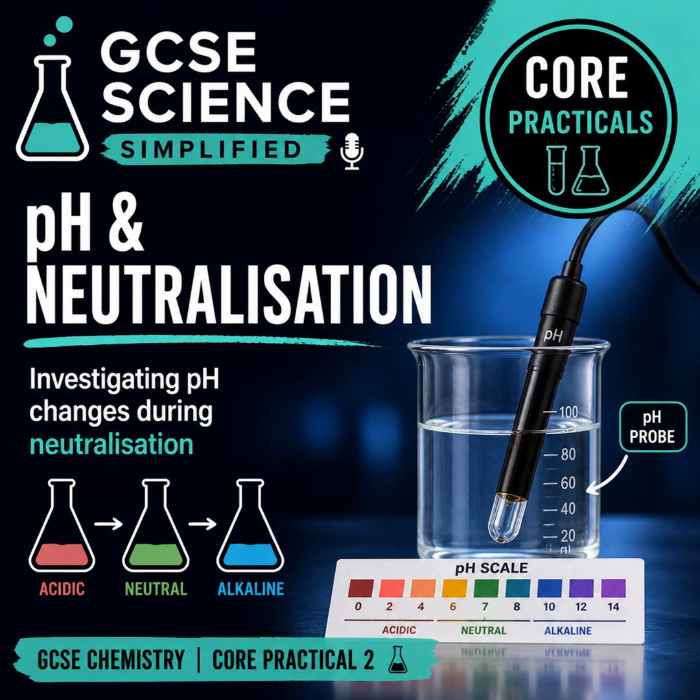In this investigation, we're reacting hydrochloric acid with either calcium hydroxide or calcium oxide. This is the white powder that you would have added to the acid. As you add the base, the white powder, the hydroxide ions react with hydrogen ions. They combine to form water. This is what neutralisation is. Think of it like cancelling out. The H+ ions react with the OH- ions to make H₂O. Each addition of more alkali removes more acid until there's none left.